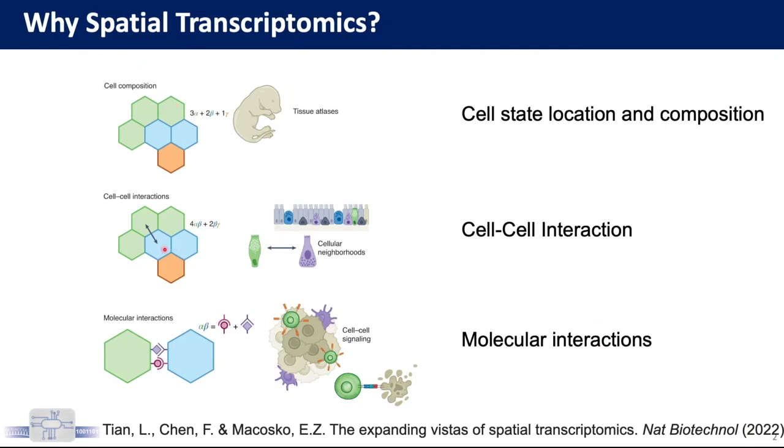However, since we don't disrupt the tissue, we can use this data, of course, also to study cell-cell interaction. This can be anything like decoding spatial dependencies of cell states, or analyzing distinct neighborhoods, which are important, for example, to guarantee homeostasis of a tissue, like, for example, in the lung, in the kidney, or in the intestine.